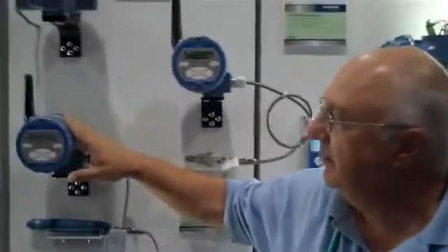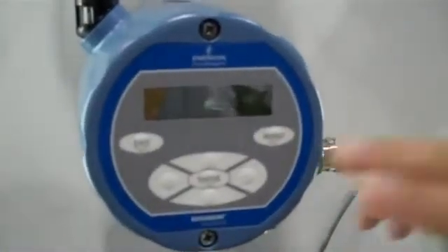What's really unique about these devices is, besides being wireless, they have an interface on them that you can actually do a quick start and get through here.